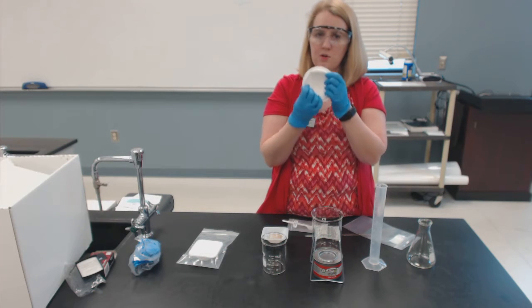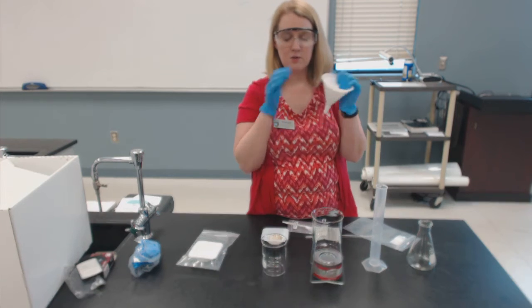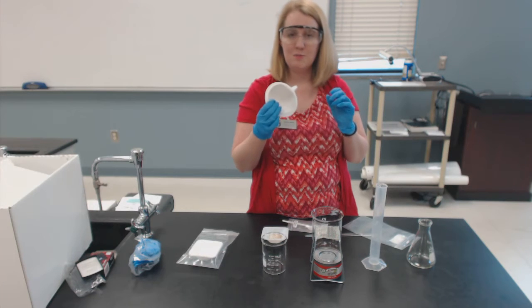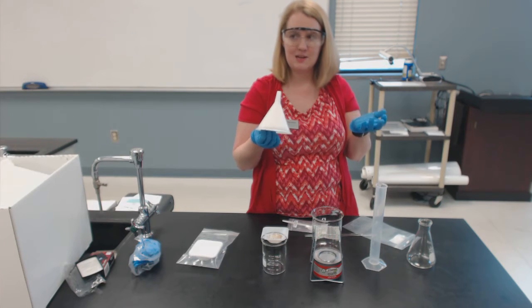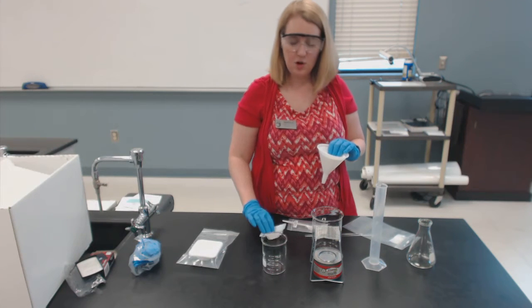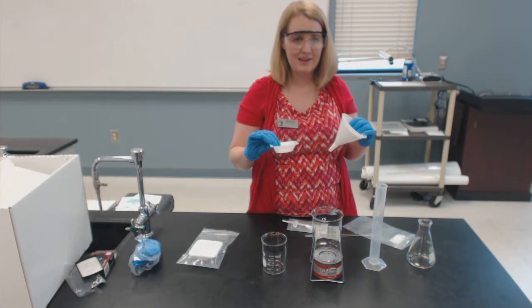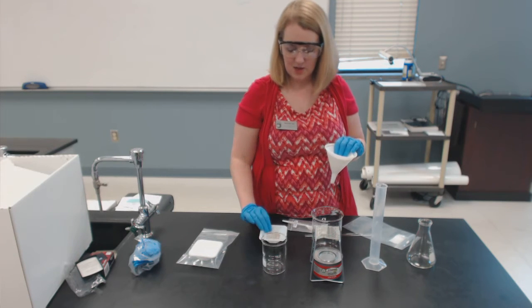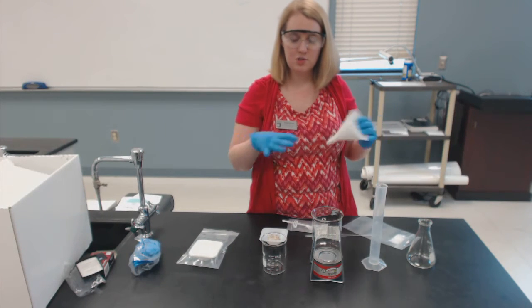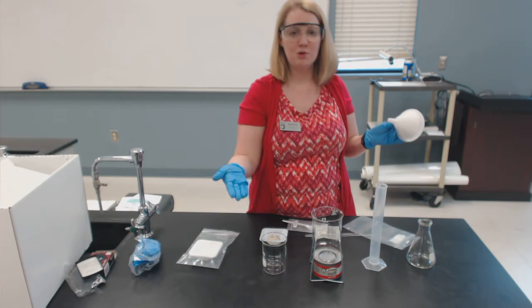Now remember, we only want to know the mass of the individual components. So if you've got sand here, and say it was filtered out of water, that means that sand is now wet. Don't just go ahead and weigh the mass of the sand, because that sand is wet, it's got water in it. You'll get the mass of the water too. So make sure whenever you're recording a mass of a component, you make sure that component is dry before you record its mass. Also, make sure that at the end of the day, you've got all these components, you've determined all of their masses, you explain directly from your procedure to your results where each number came from.